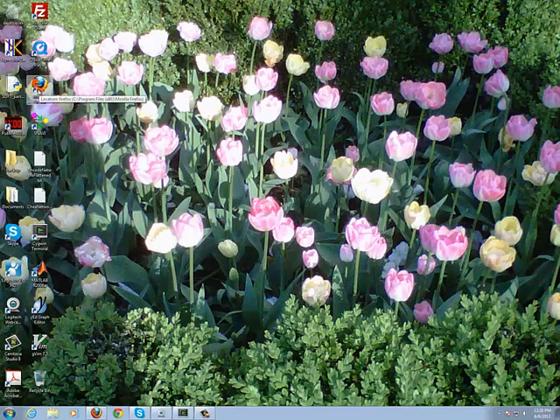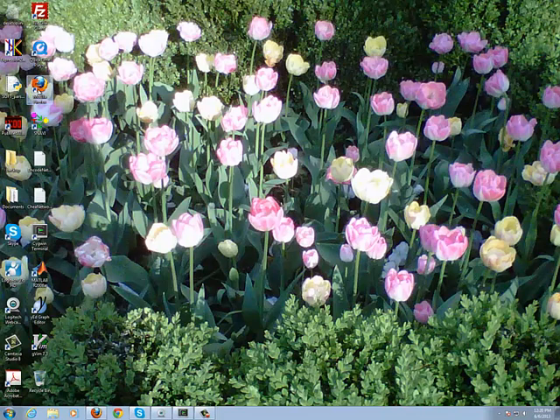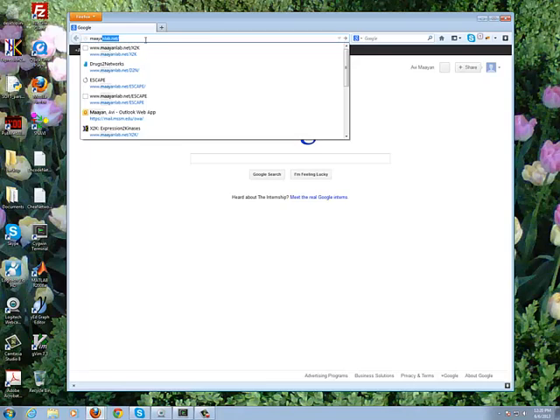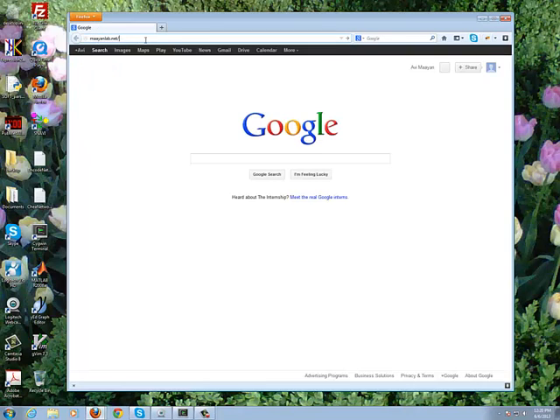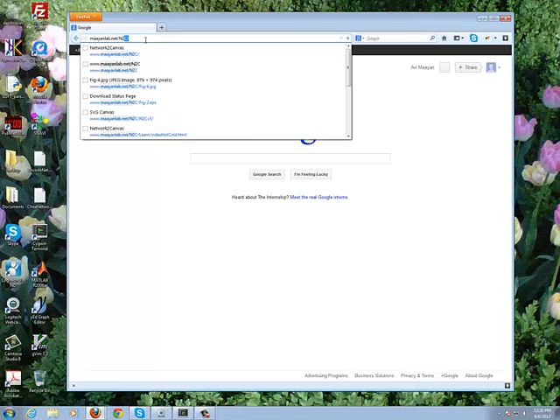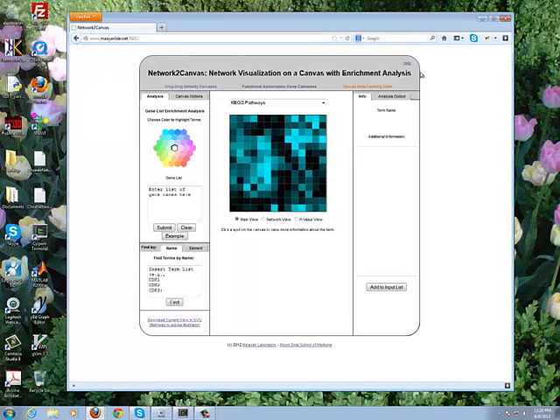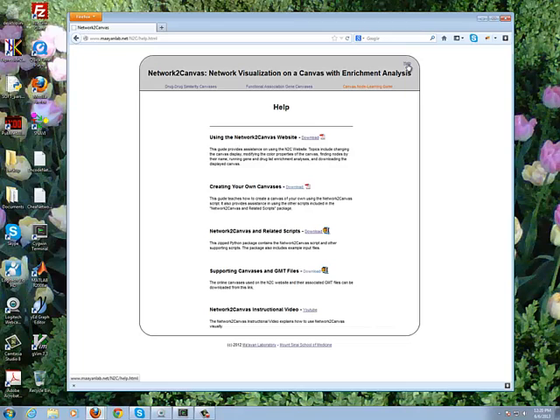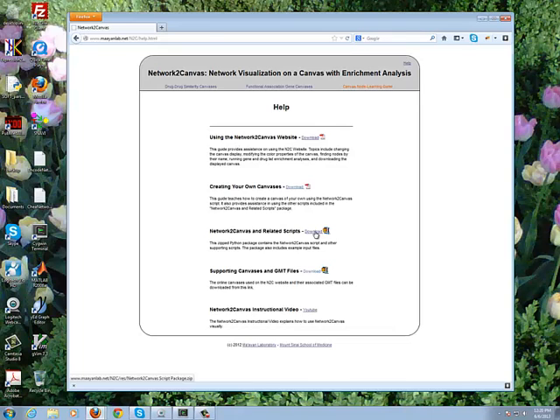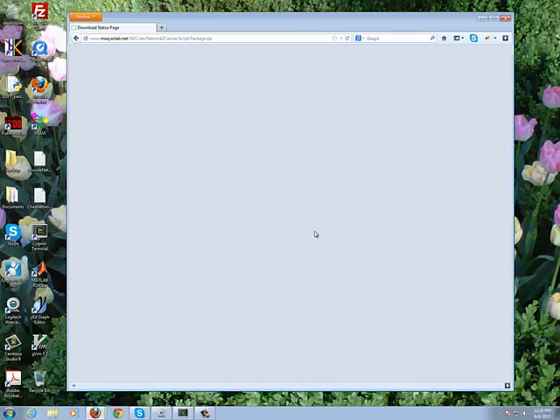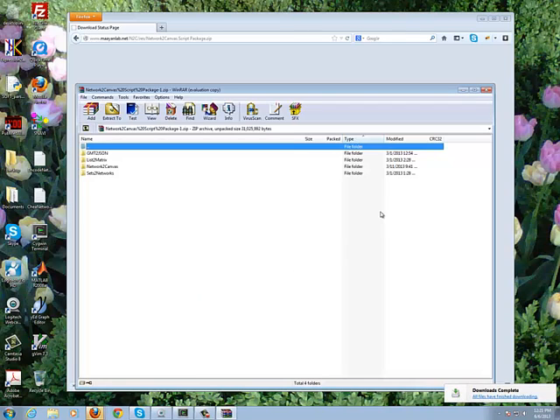So first let's download those scripts. We have to go to the web and type in the URL mayanlab.net/n2c. And then on the right top corner there is a link to help. Once you click on that link, there is a download link for the network-to-canvas related scripts. So you download this zipped package and you can open it.